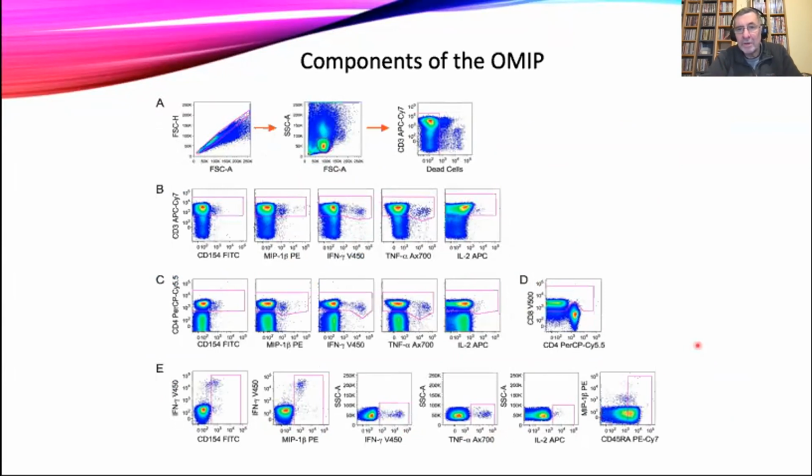So, you may never do anything in this particular type of biology, but sometimes these papers are actually quite a good thing to look at, because it does help you understand how that panel has been developed and how that fits into the cytometer that it's been run on. Remember, those 2 things are equally important in panel design: the reagents, the fluorochromes you're using, the cytometer you're using, and the biology that's underpinning all of that.